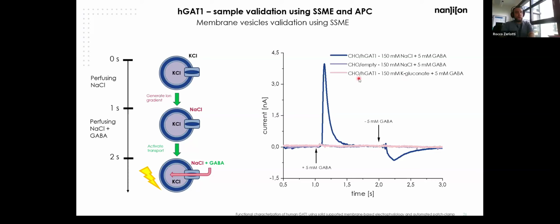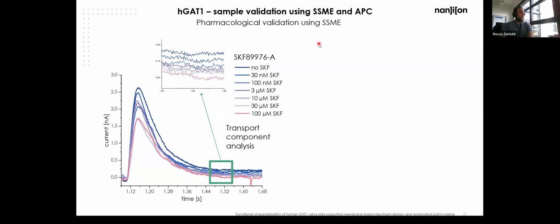We also did some very rough pharmacological validation using, again, solid supported membrane electrophysiology. We used this very well-known GABA transport inhibitor, SKF. Here we analyzed the transport component.